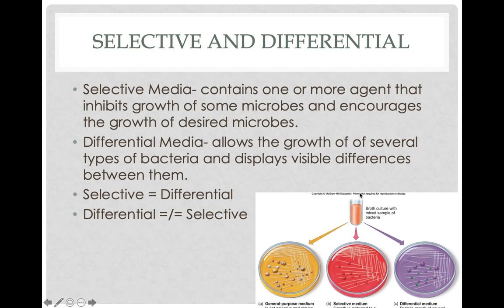So what you do is you take a sample from your patient and you spread it on an agar that contains lots and lots and lots of salt. What's going to happen is the bacteria that can't tolerate the salt are going to die. And if there's staph present, they're going to be able to survive and grow. And you're going to go, oh, there's not supposed to be staph there, but there is. I can see them because they grew. All the rest of the stuff that's supposed to be there died. The only thing that grew is something that's not supposed to be there.